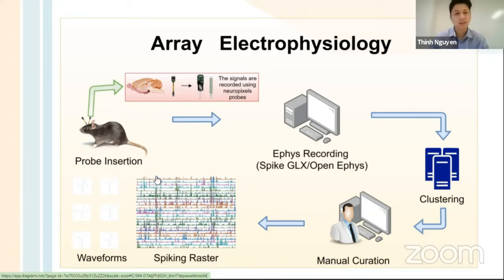You can segment these, you can align them with some interesting behavior that you're running, you can cluster them, all kinds of downstream analysis to answer your specific scientific questions. But a lot of the steps really end at: perform the surgery, put the probes in, do some data collection, and then do some spike sorting, arrive at your cells, your neurons, and then do further analysis on that.